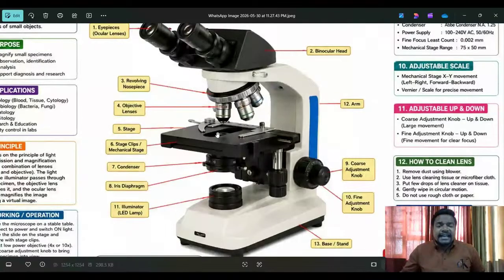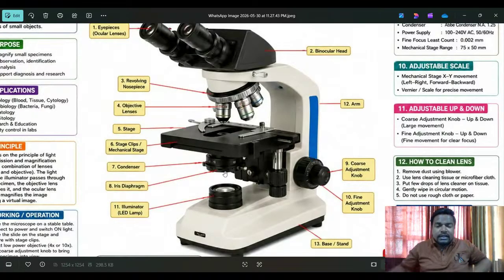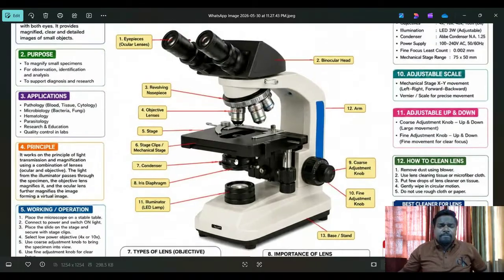And you have to keep the slide here, this is the vernier scale. There you have to fix that slide. Then you have to change the intensity as your requirement, and also remove the lens cap, and then sit on the chair and keep the position, then observe like this. So you have to bring your eyes to those eyepieces. That is the working principle, very simple, understand.